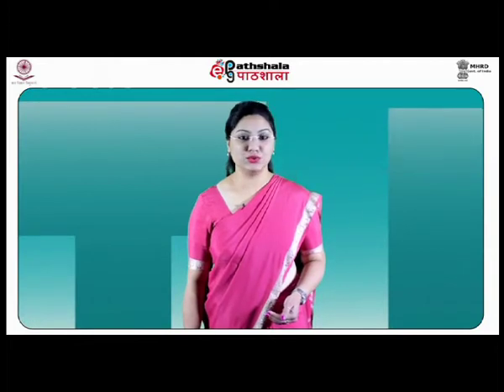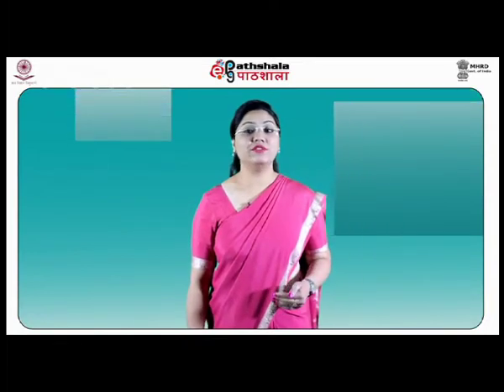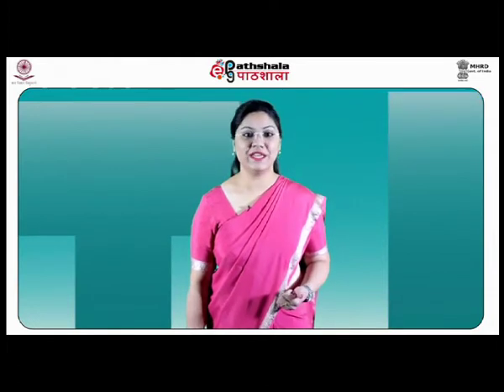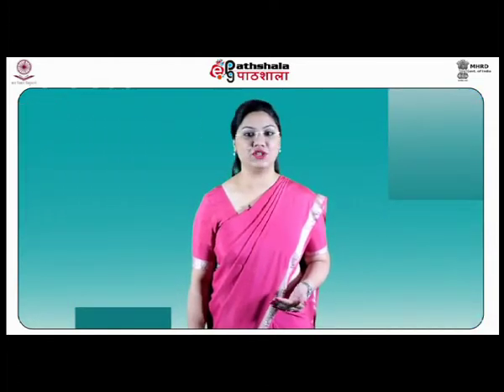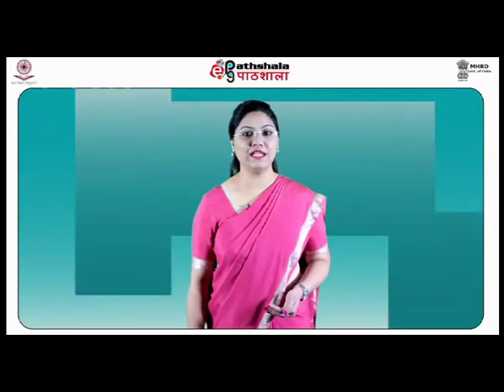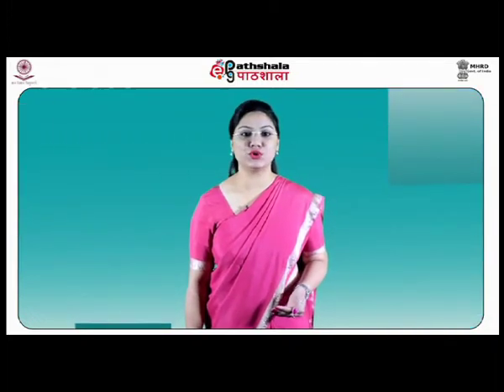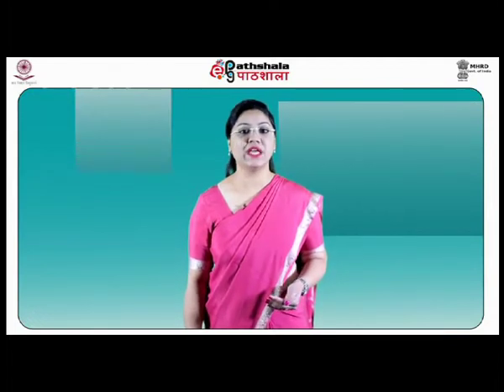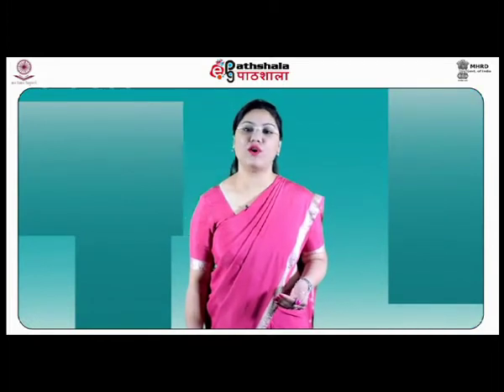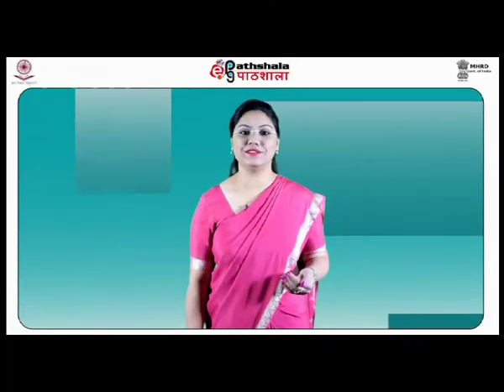The brain tissue needs to be prepared for microscopic examination. The following procedure is adopted. The first step is to do fixation of the brain tissue so that it will not change its shape. For that, it is put into formalin. Formalin is a solution of formaldehyde gas. It stops autolysis, which is the self-dissolution of the tissue, and kills microorganisms that may destroy the tissue.